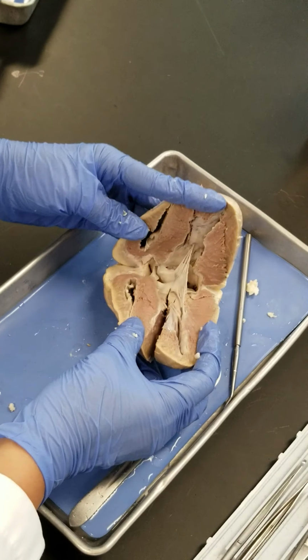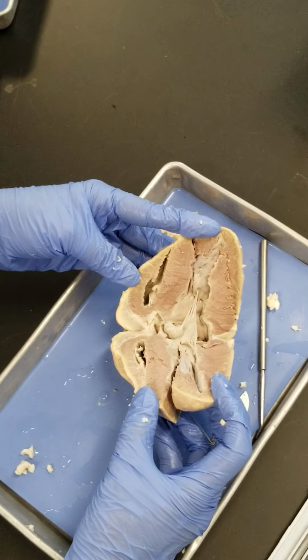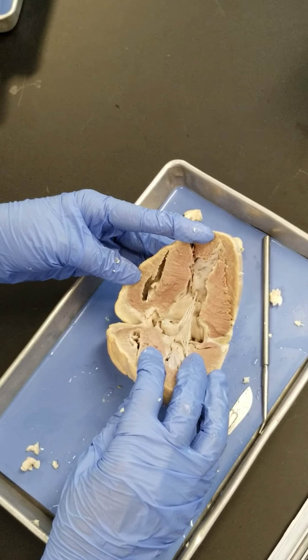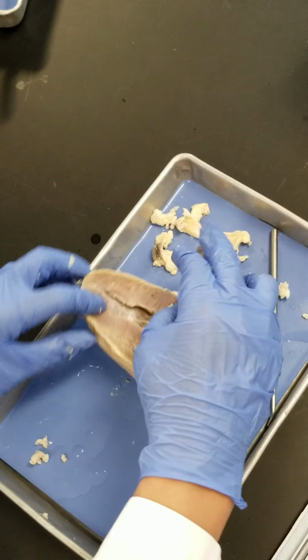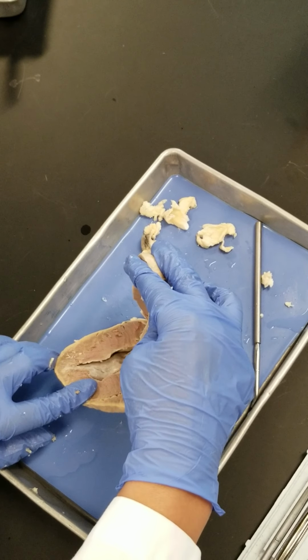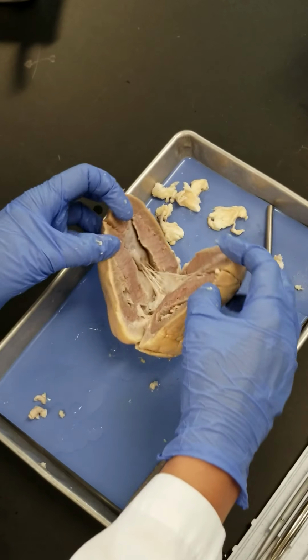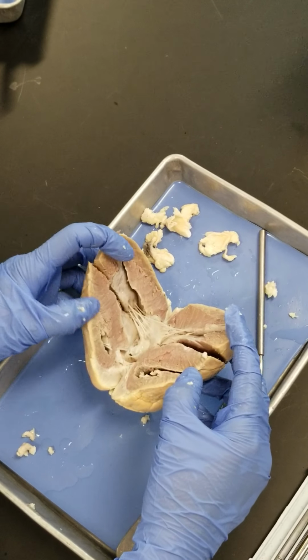When I open this one, look at this. This is what you see here, right? So I look in this lower part here. But just pay attention. I might put it like this in front of you, or I might put it like this in front of you. I shouldn't have to put it in an anatomical position exactly, so each side might be right or left. The clue is that you're searching for the thickness of the free wall.